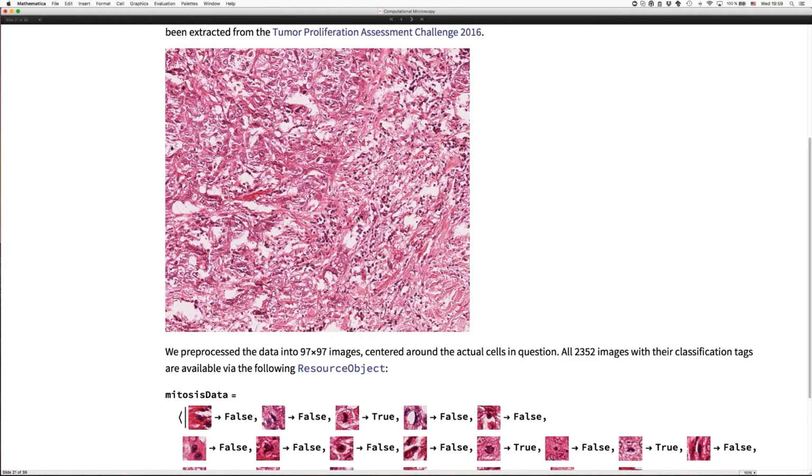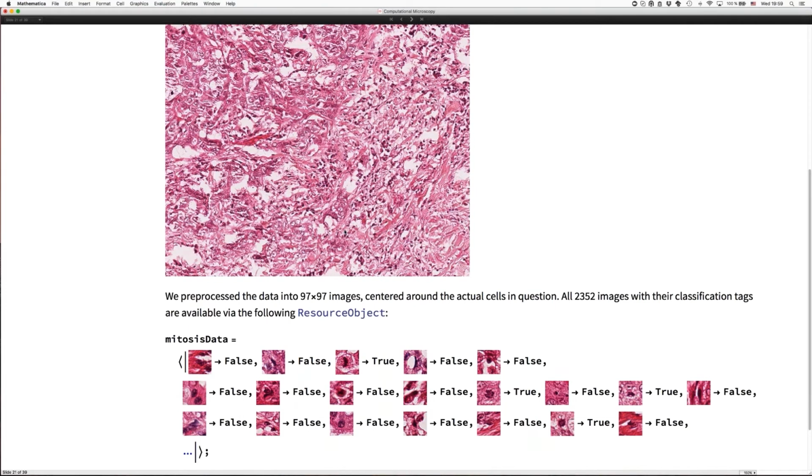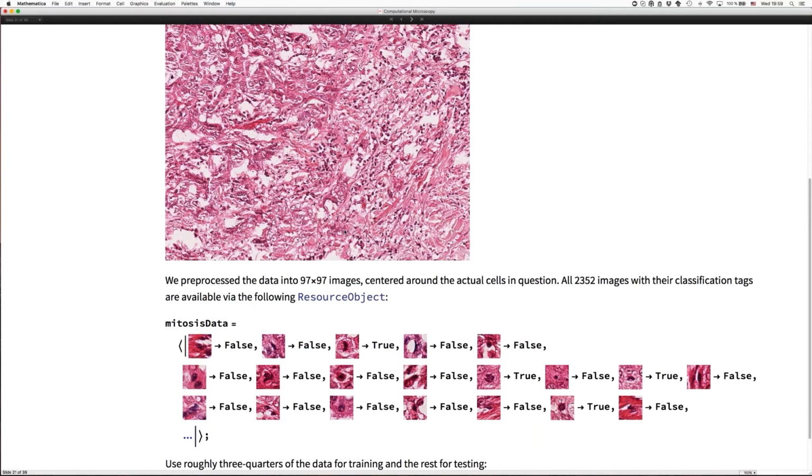These mitoses don't come in cells that very nicely show two nuclei or a nucleus about to divide. No, the data essentially looks like this. This is part of data taken from this larger screen via ordinary image processing methods.